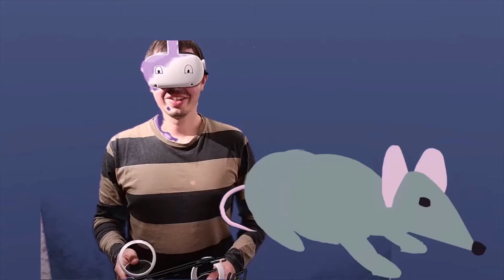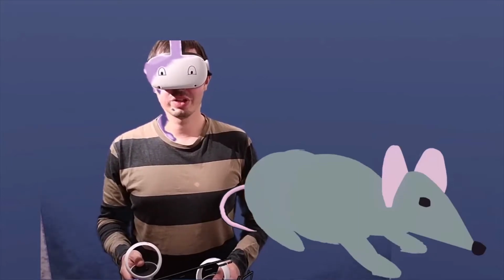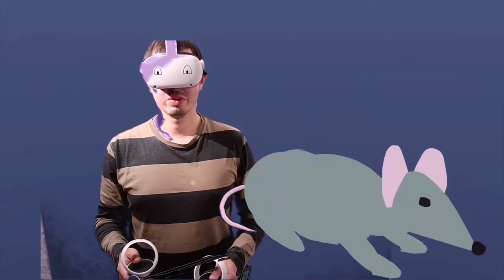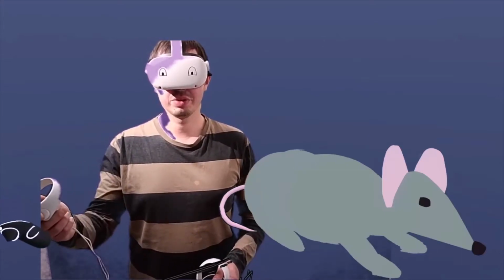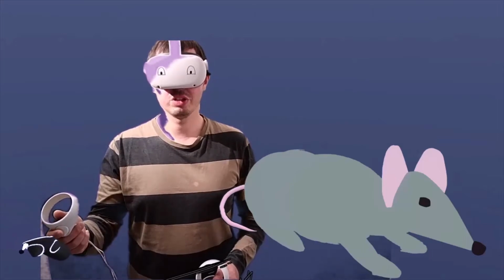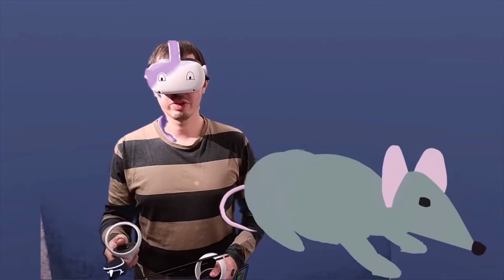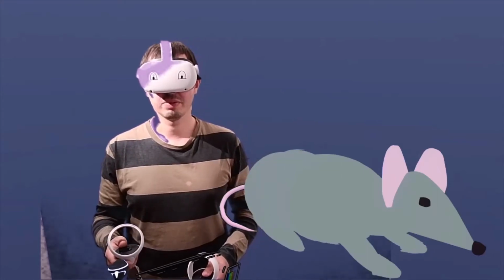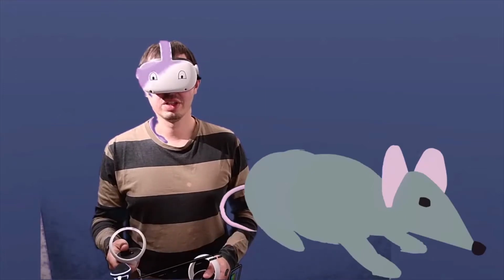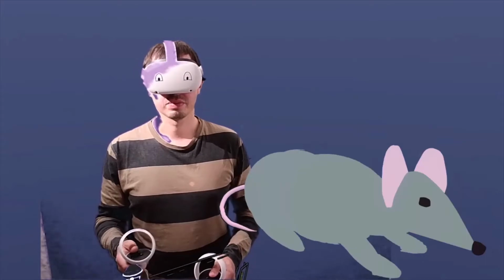Hey guys, welcome to this VR video about bioproduction. In this video we're going to go through the steps that will lead us from the mouse to a biomanufacturing of a protein, which is going to be a monoclonal antibody. I chose this example because it is very relevant regarding the market of biopharmaceuticals, and monoclonal antibodies are now proteins that are widely used in human therapeutics.